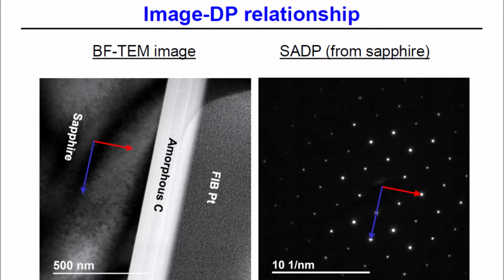I should also note that this may depend on the configuration of your Tecnai. On the one I'm going to do this on, this was done with a 200 keV instrument with a super twin lens. This is likely dependent on your objective lens configuration as well as the voltage you are operating at.